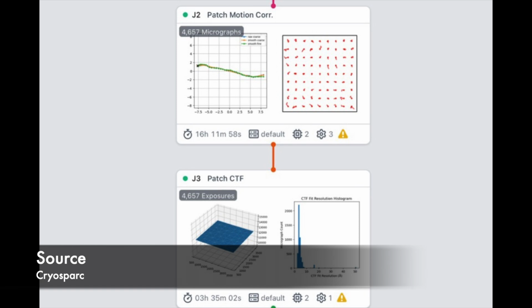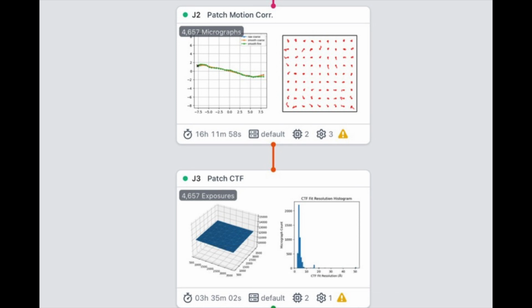But you have to do this motion correction, not because the receptors and toxin are moving around much, even at negative 180. The type of motion we're correcting for is that, as I mentioned, we're shooting electrons near the speed of light at this sample. Since these electrons have a lot of energy, they cause the ice to expand.